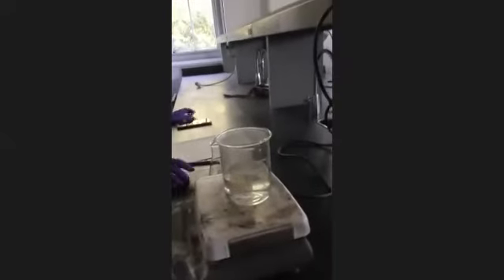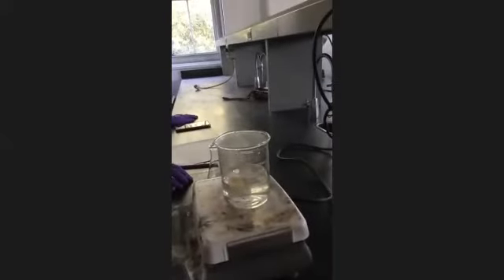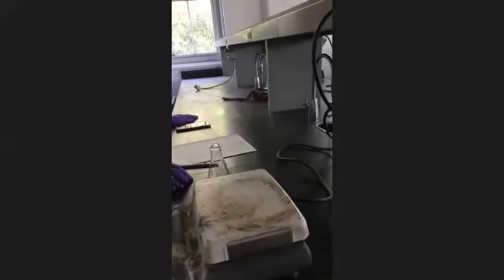All right. So now we're going to get that cold water and we're going to zap it. We're going to repurpose our water bath. That's called being efficient. So we're going to take the hot water bath, dump that water out and put some ice in here and turn it into an ice bath. That's why we work with tempered glass, so you can go between temperatures without having to worry about the glass shattering on you.